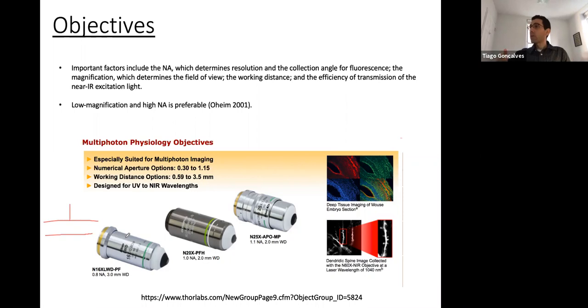You don't have anything that is just a flat, uniform illumination. So you expand your laser beam, and that's why you need this beam expander, which is usually just a little telescope, 2 lenses. The problem is that it's a trade-off, because if you expand it too much, you lose power, because your beam will be very broad and start hitting the metal around the lens, right?